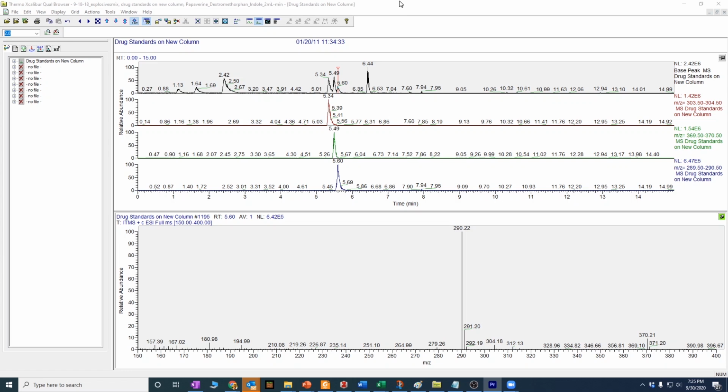There is another arrangement we'll talk about later in the semester, a scanning instrument, but almost all UV detectors for LC are photodiode arrays. There are a lot of different types of mass spectrometers that you can connect to an HPLC, but if you can afford it, the mass spectrometer is the best detector for most things coming out of the LC, because you get a lot of information about the peaks in the chromatogram. It's very good information, and for some of the mass spectrometers, it can push you into category A.